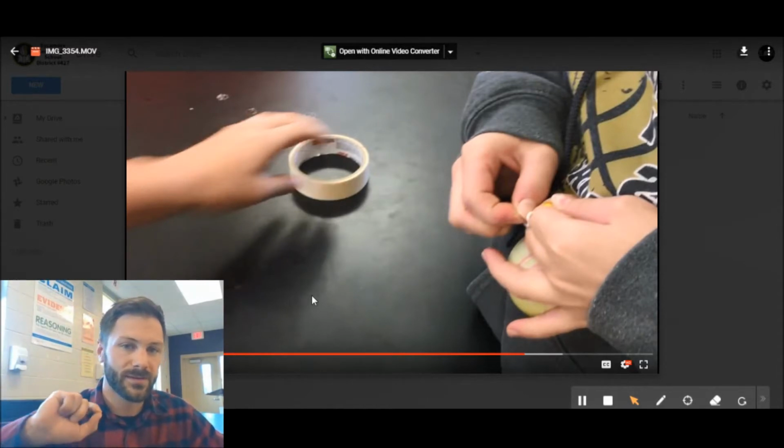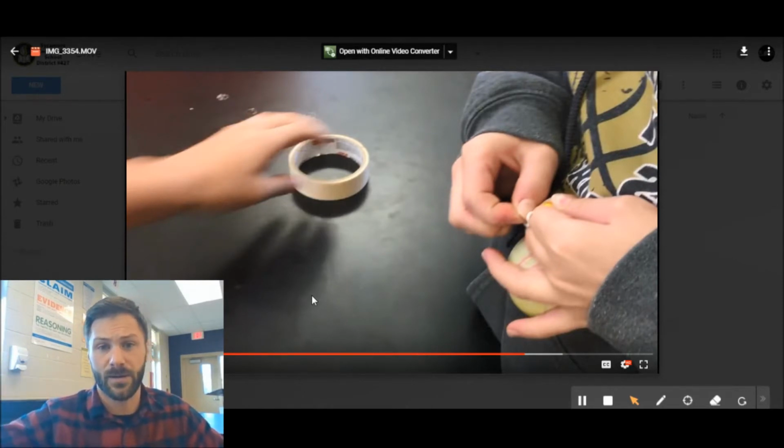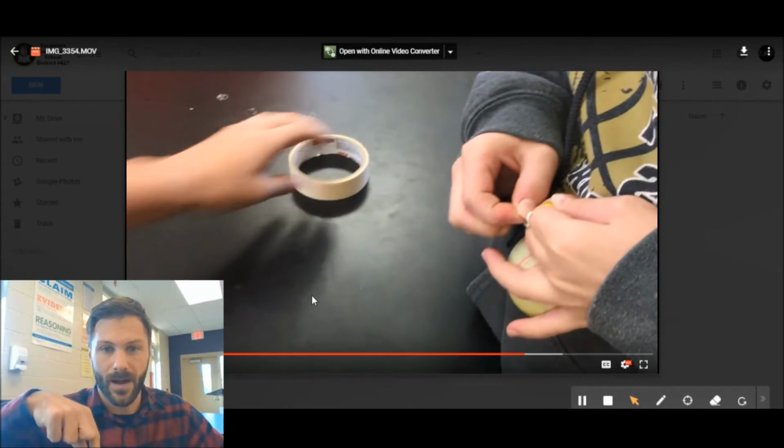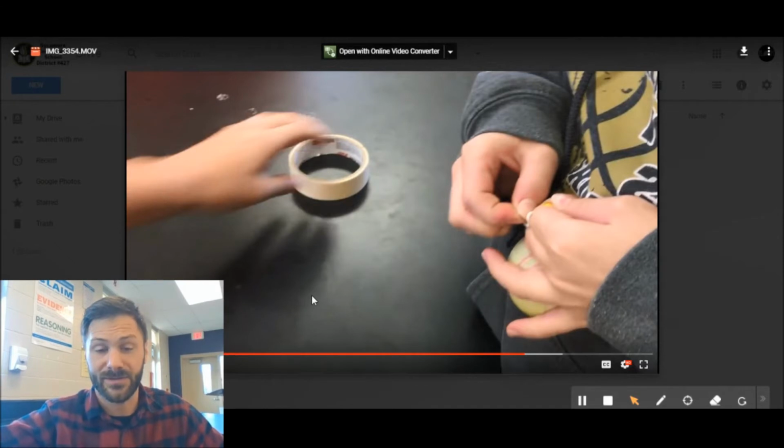So the first piece of evidence that we collect that might tell us what gas is inside the balloon is that it's less dense than the air around it. It's a very light gas. Lighter gases float. The lesser dense gases float. More dense gases sink. Look up people inhaling some of these gases online, not hydrogen. Okay, but like helium, your voice gets high because it's less dense.